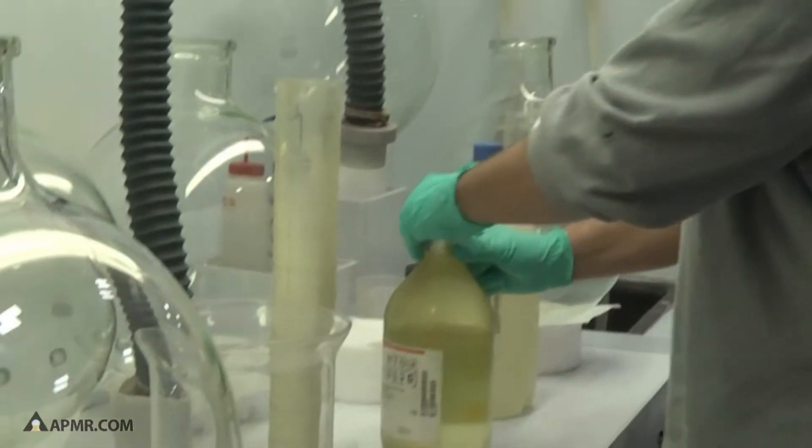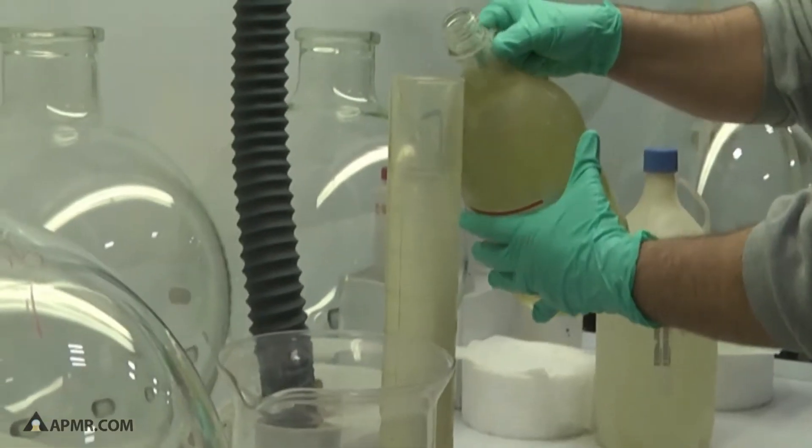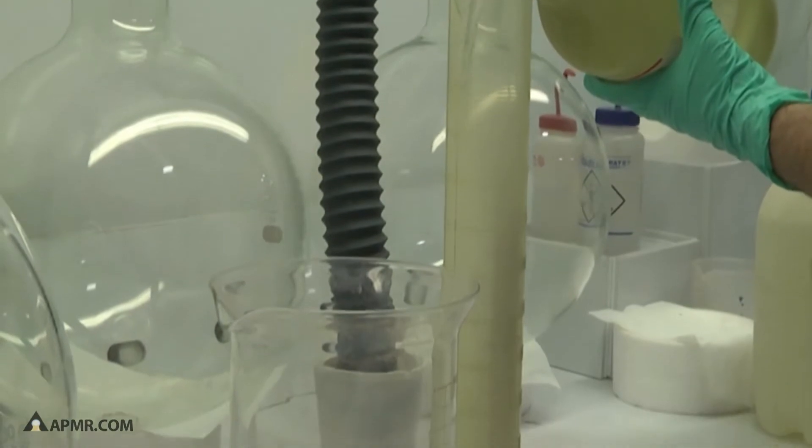This is an example of a digestion of a four metal scrap lot. Now this is only a portion of one of our typical scrap lots. But the first step is mixing our two types of acids together.